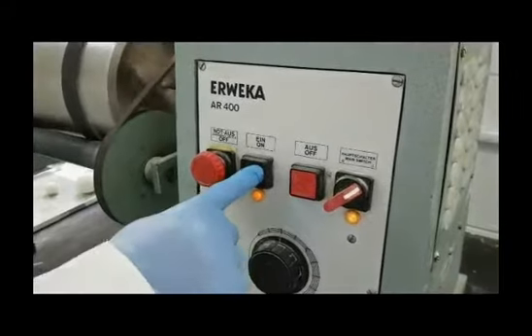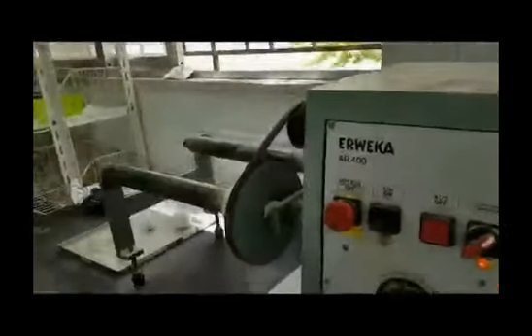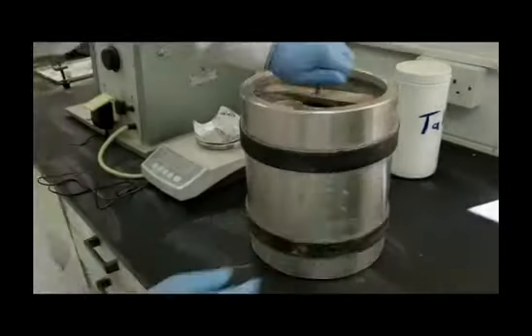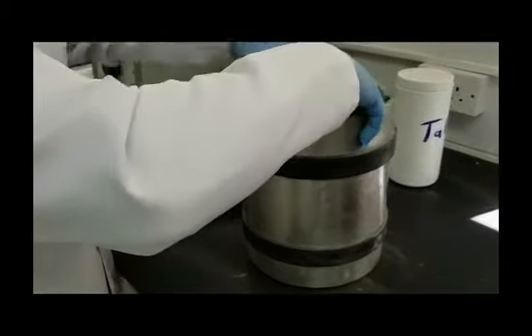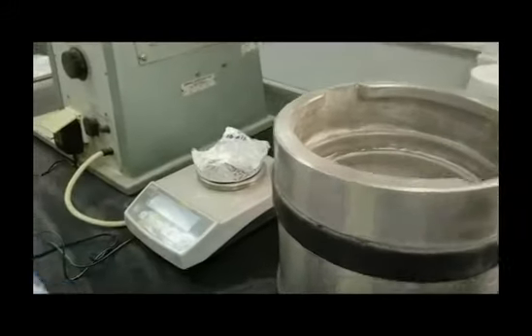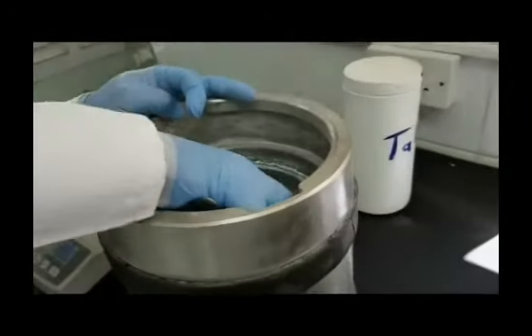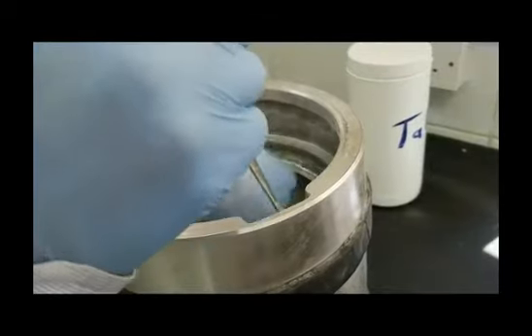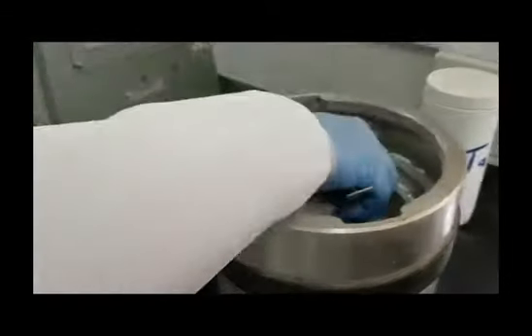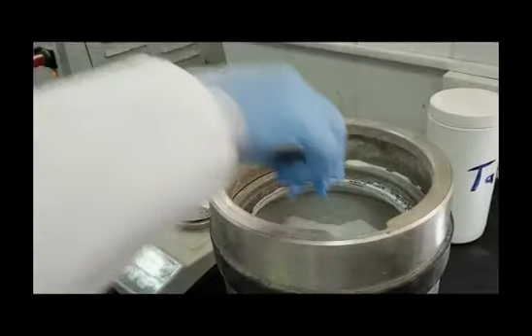Place the ordered sieves on the sieve shaker. After 10 minutes of milling at 30 RPM, withdraw a 50-gram sample. Use a tin paper or aluminum foil shaped and labeled correctly. To do so, use a spatula. You may also need to remove some balls. If you removed any balls, retain all balls again to the milling chamber after withdrawing the sample.